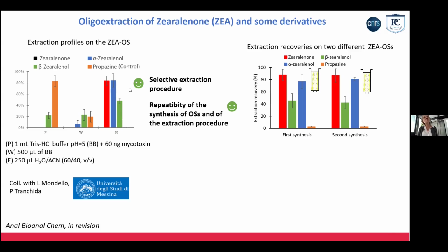In terms of green chemical analysis, do you use ethanol as a mobile phase? No, because of the viscosity. Okay. So I prefer to miniaturize than to replace acetonitrile or methanol by ethanol. The viscosity is higher. And it's the high pressure. Yes. It develops our system, the pressure is dropping in our instruments. But I have a student in my lab, a PhD, with a collaboration with a small company that wants to develop an analytical device for on-site analysis, monitoring of pesticide, and we have to develop a synthesis in green solvent and an extraction procedure in green solvent. So we replace methanol by ethanol because when using the cartridge, it's not a problem. But for chromatography, we don't.